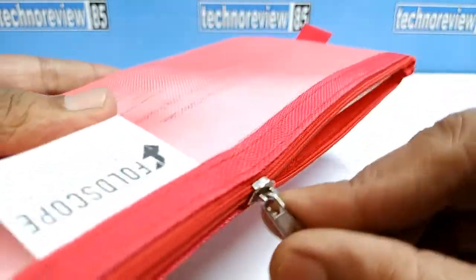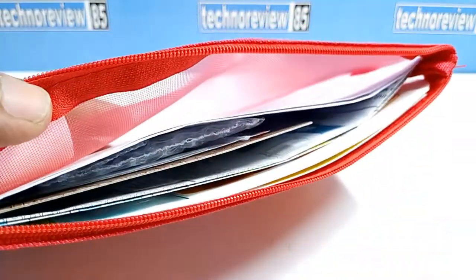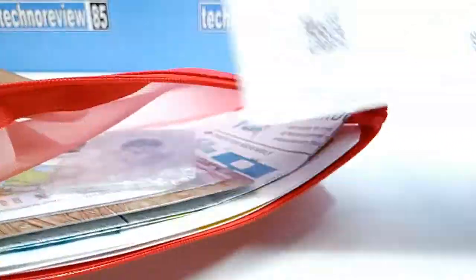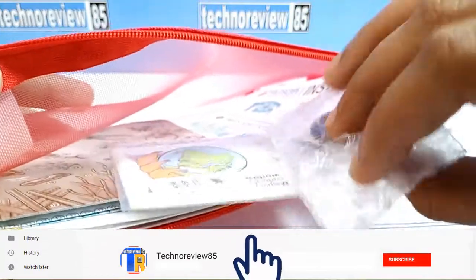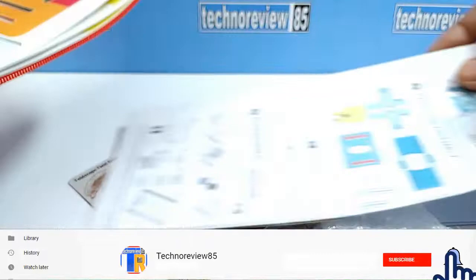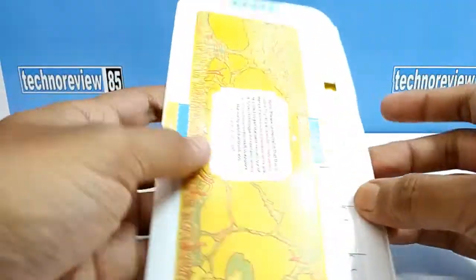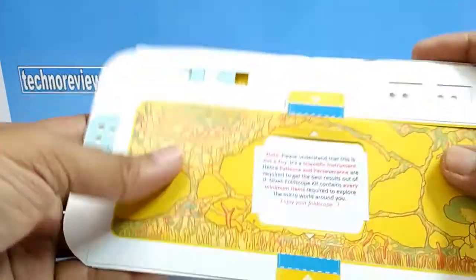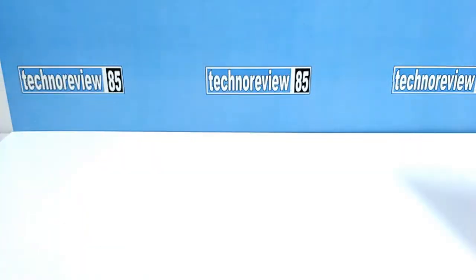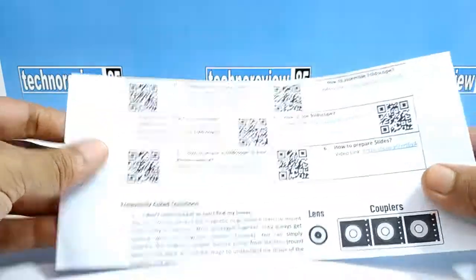This is the pouch of this paper microscope kit. It is the Foldscope basic kit, and an advanced kit is also available. It is a single lens microscope. This microscope kit comes inside this pouch. It is a document about its content, website and app links, etc.